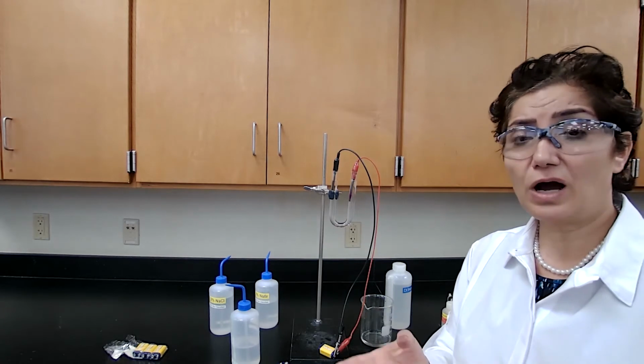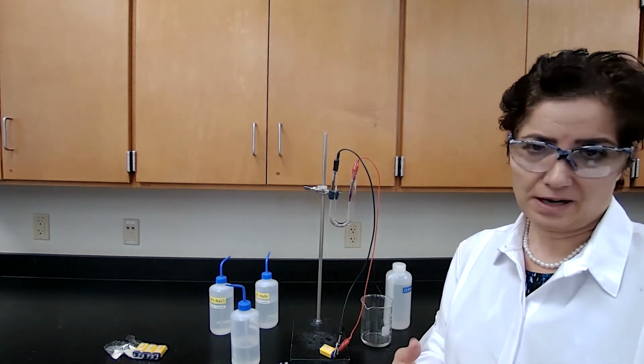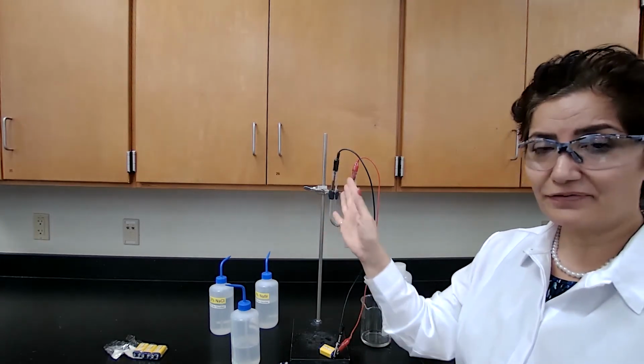For the choices for oxidation, we have the iodide ion, I minus, that can be oxidized on the anode side, which is the left side.